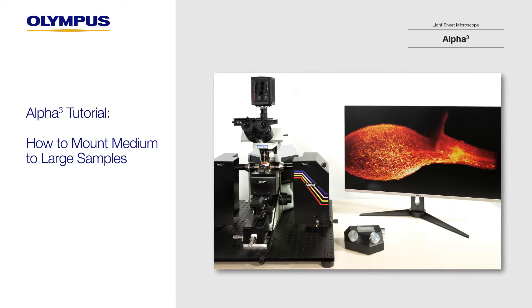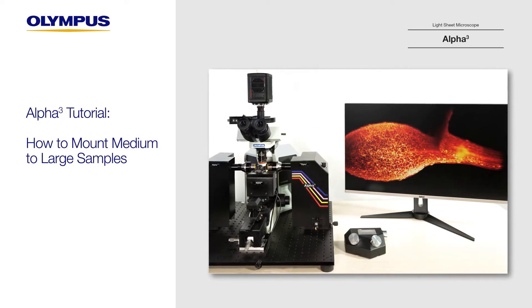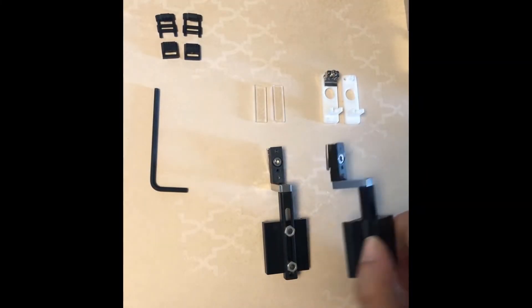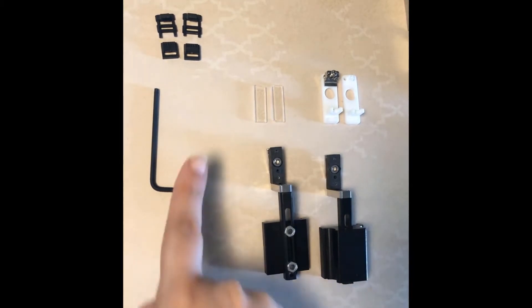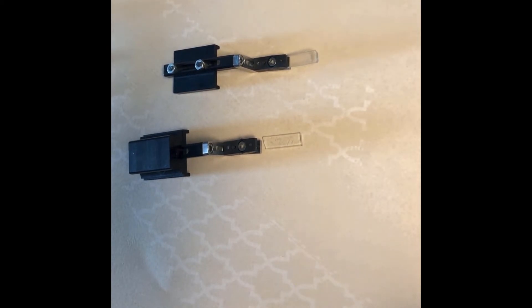In this video we will demonstrate how to mount larger samples using the sample holder, glass support, and pinchers. The sample holder supports the various sample mounts that come with the Alpha3 chamber. Samples can be mounted in many ways; in general, all medium to large samples such as adult zebrafish and mouse brains can be mounted on this glass support.